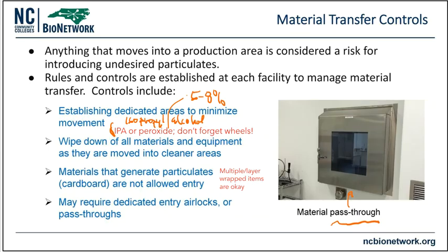And again, we want it to be a little bit stronger because we want to ensure absolutely as much as can be involved is going to be killed, and it's going to be sanitized for us, not only on our work surface areas, but any type of bottle, any type of instrument, any type of tool that I'm using in that production area. Those always have to be sterilized and sanitized as well in some kind of format, in some type of form. So wipe down everything, including equipment, as we go cleaner and cleaner and cleaner.